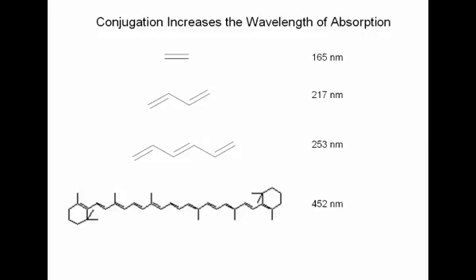So when we go to something that's really, really conjugated, like carotene, in carotene, you've got lots of double bonds in conjugation. Carotene is the yellow pigment that's in spinach. If you've done biology lab, I still think they do the TLC of spinach pigments. We did it in my lab. Carrots, the yellow pigment that's in carrots, is carotene. Look at, for all of that conjugation, the wavelength that it absorbs at is 452. What does it transmit? It transmits yellow. It transmits a yellow color, so the carotene looks yellow.